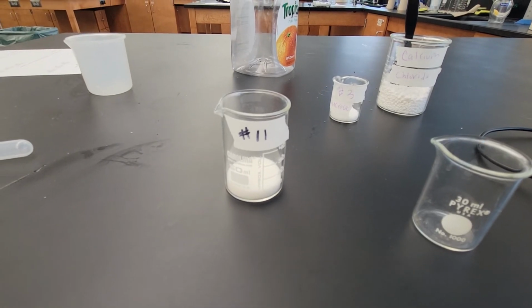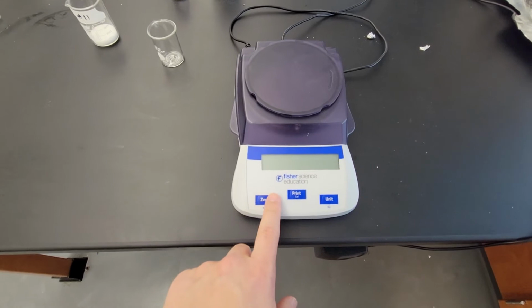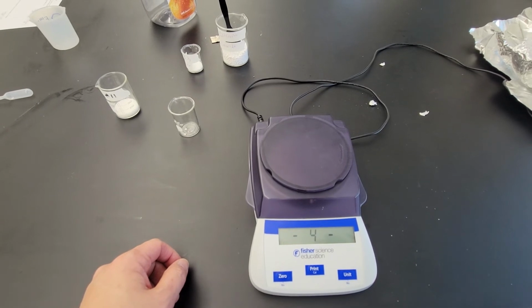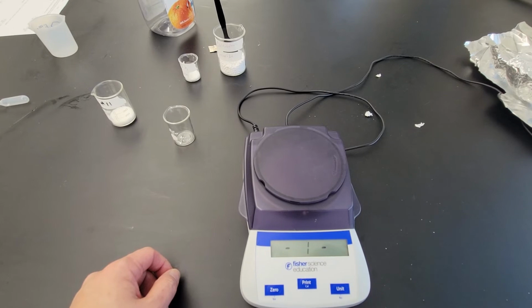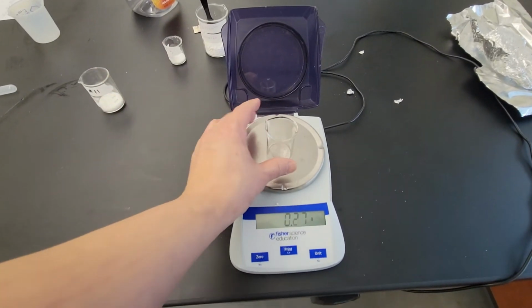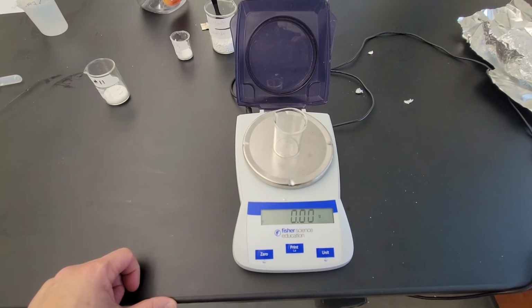So here's beaker 11 with the sucrose that we're looking for. Let's turn our scale on. Let it calibrate. Get a clean, dry beaker. This one looks clean and dry. Let's zero that out. Wait for the snowflake.